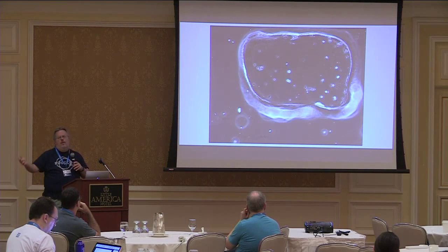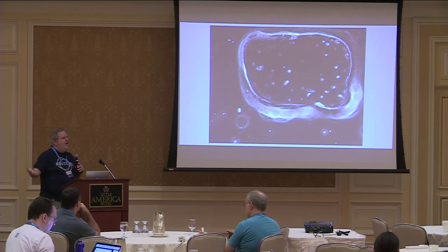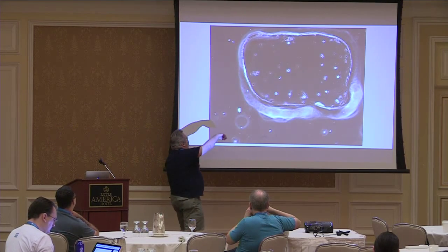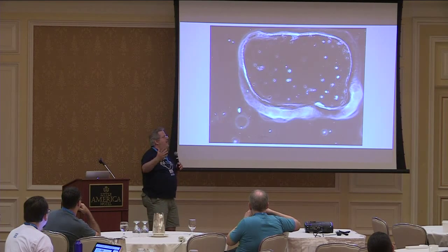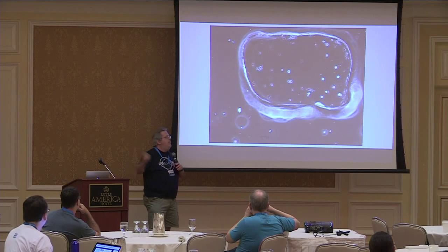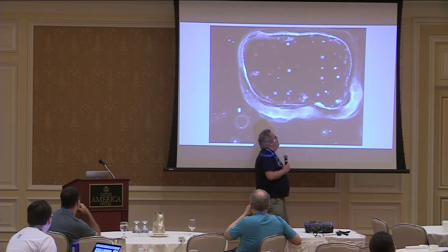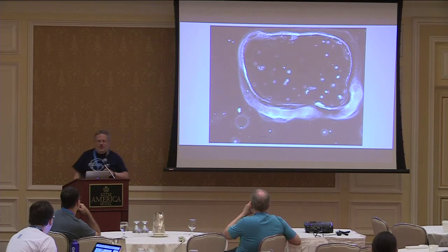Normally we use a program on Windows called IrfanView, which is really good for scanning through pictures, but I have a Mac and it doesn't run on the Mac. So you can kind of see that this oddly shaped thing around the side, that's actually the well that they were growing them in. I still don't really understand why they all look so odd, and they're all different from every single one of the movies that we got. But you kind of see, it's a little hard to see probably, one cell division that's right there. And the cells are kind of moving around. Even the dead ones are moving around, and I don't understand that either.